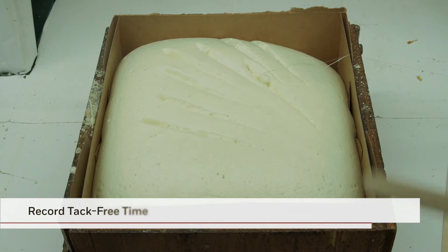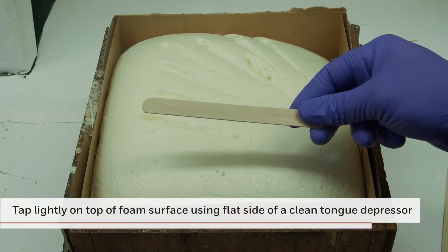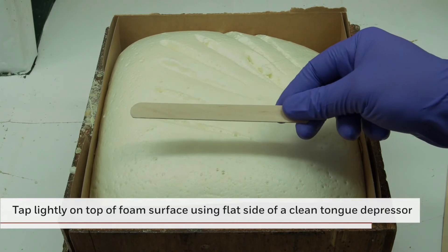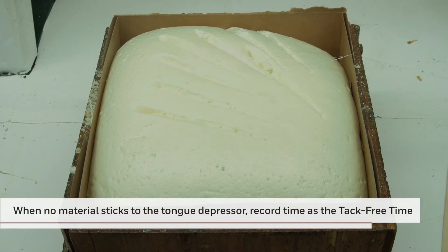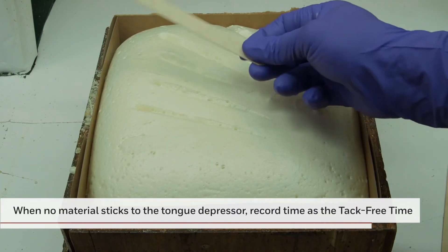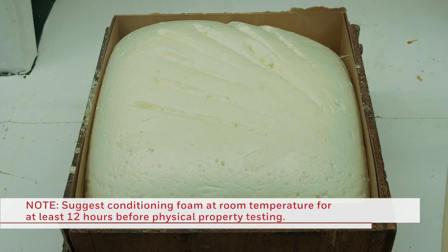Next, you can test for the tack-free time. For this test, the flat side of a clean tongue depressor is tapped lightly on top of the foam surface. The absence of foam sticking to the clean, flat surface of the tongue depressor indicates the tack-free time of the foam. This concludes the reactivity testing.